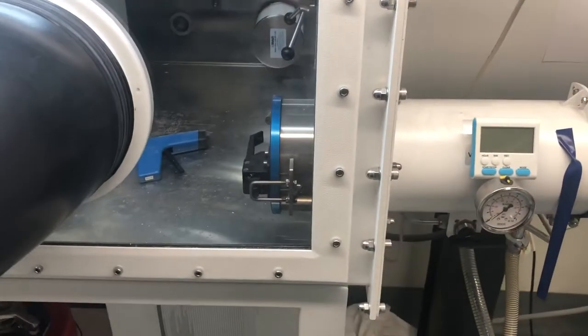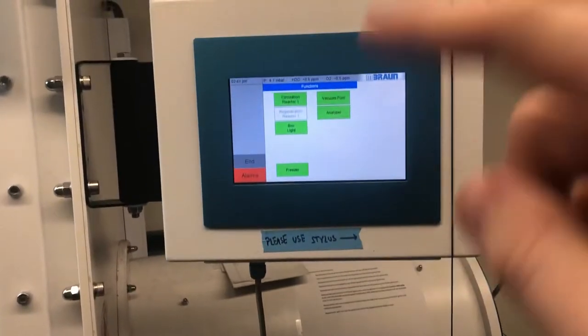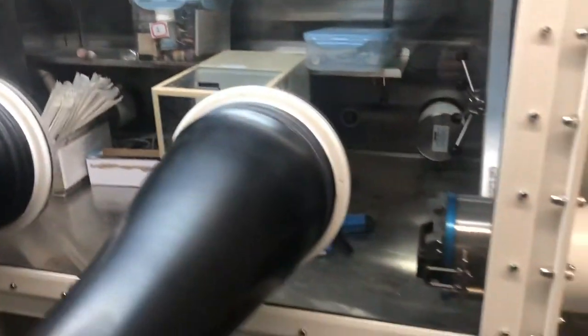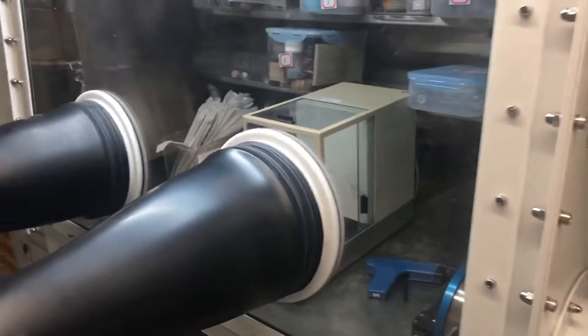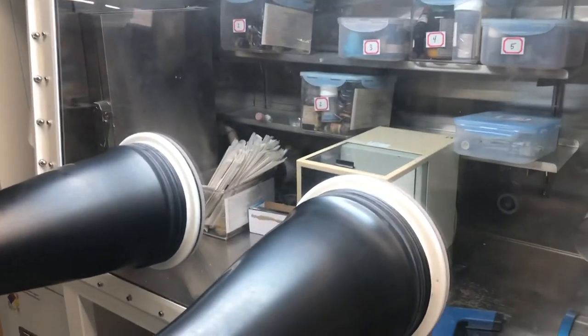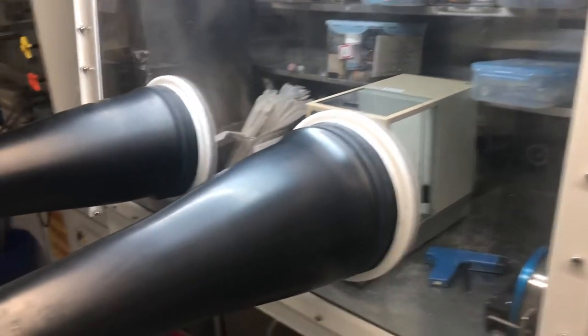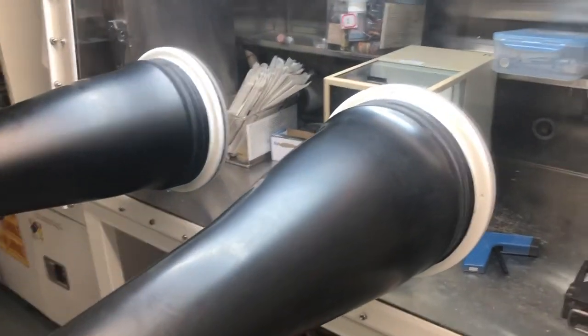For the duration of your time in the glove box, the vacuum and the circulation should be on. If you're working with a liquid, you're going to turn off circulation for the duration of your time in the glove box. When you're done working in the glove box, you will go to purge the glove box only if you use a liquid. Go to the purging video in order to see how that is done.